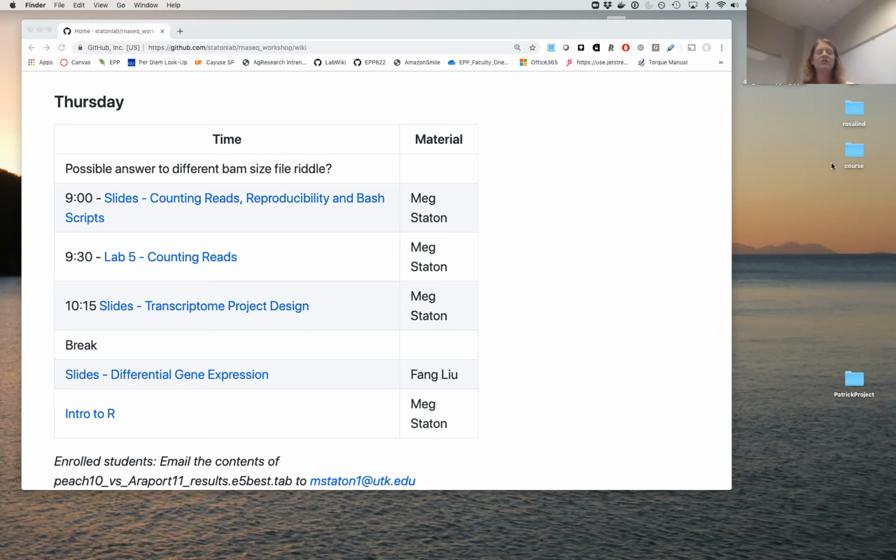There may be other factors involved, but it looks to me primarily like STAR was using a different level of compression. And then we decompressed it and recompressed it using a different level than the original, so we got 2 BAM files from the identical SAM file, but of 2 different sizes. That was pretty interesting because I didn't realize there were multiple levels.